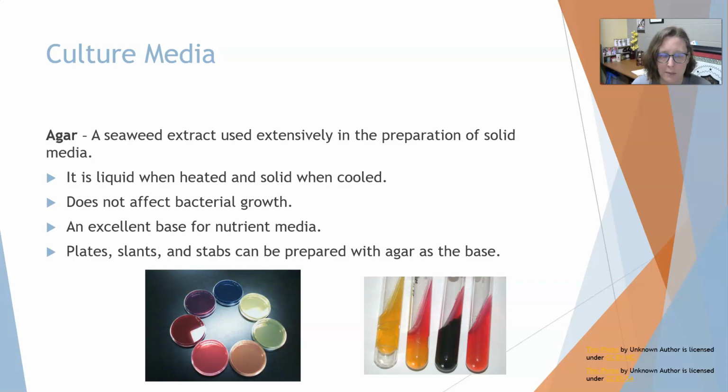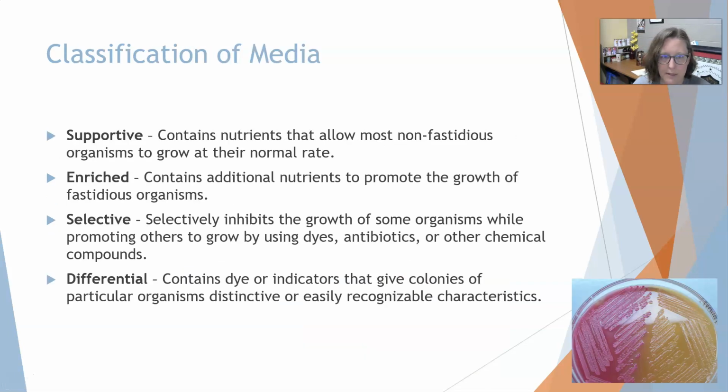It does not affect bacterial growth, meaning that the bacteria grow on top of the agar, but it doesn't break the agar down. Okay. It's an excellent base for the nutrient media. So the nutrient media are the nutrients that we give the bacteria to grow. And with agar, you can make plates, as shown here. Slants right here. This is a slant, and stabs. So with a stab, you would actually stab the culture into the gel here, into the agar. And all of those are done with agar as the base.